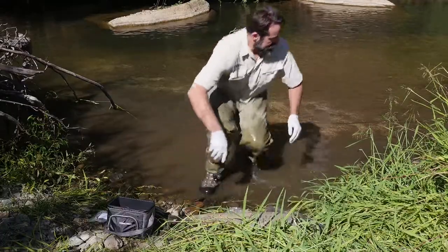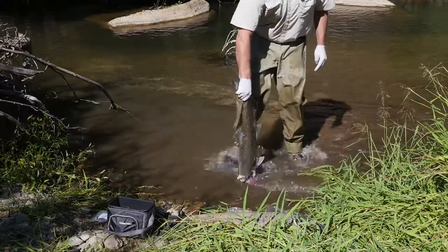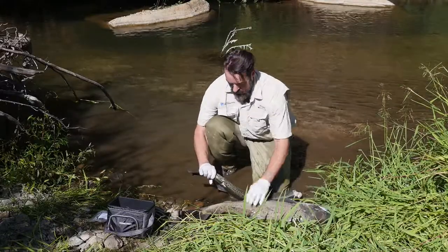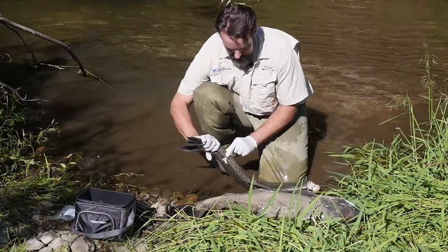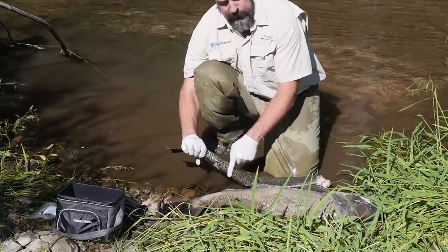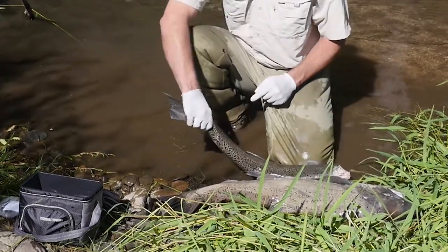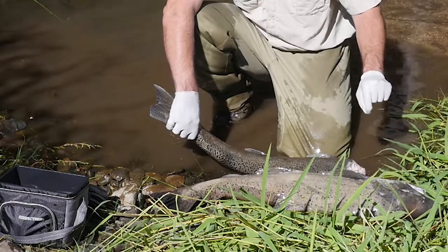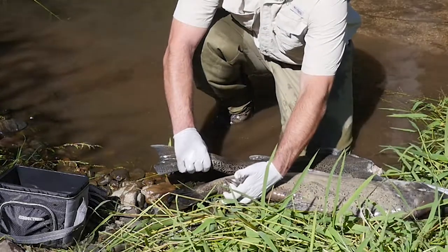Now we have a fish here that does not have an adipose fin clip. The head's already been removed — you can ignore that — but you can see in this fish that fleshy lobe is missing, and if you look closely you can see there's a little bit of scar tissue there. So this adipose fin was clipped off in the hatchery when this fish was a baby before it was released, and that tells us that in its head there's a coded wire tag that we need to recover. That's the difference between adipose fin present and no adipose fin.